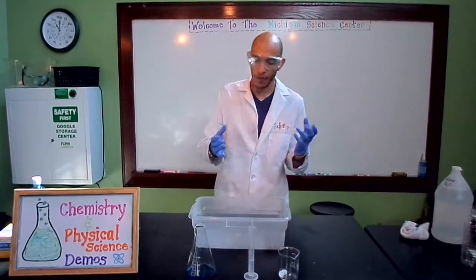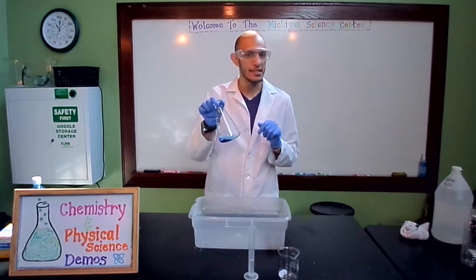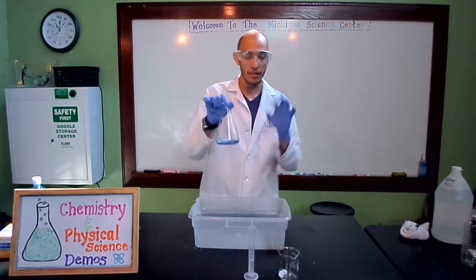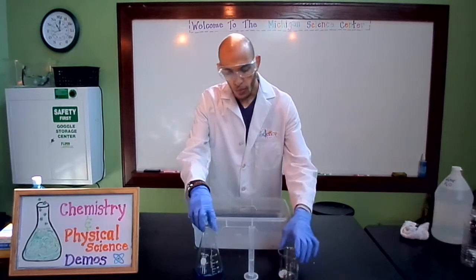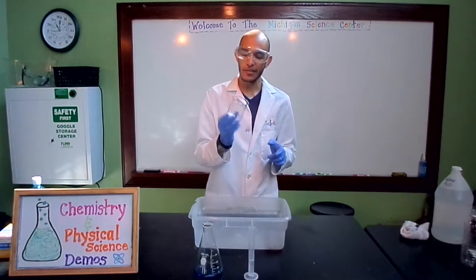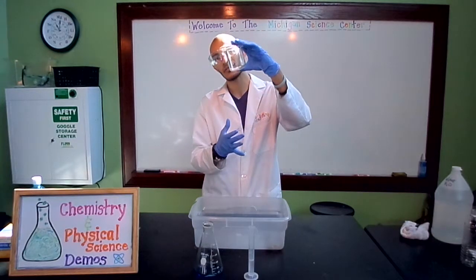So, you can't really try this at home because it could get a little messy and a little dangerous, but we have some things that you've probably heard of. We've got some hydrogen peroxide over here. Now this is the strong, nasty stuff. You probably don't want to put your hands in it. That's why we have all these safety shenanigans over here. And then we've got some potassium iodide, which is basically a salt. And it's really non-toxic, kind of looks like a salt in crystalline form.